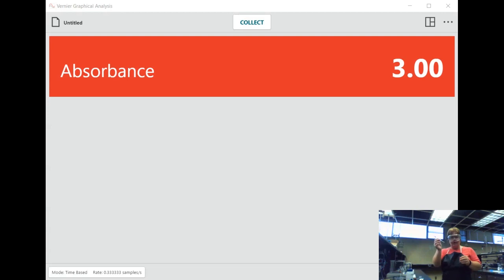And if you're not good at pouring, you can use a pipette and pipette it in. Put the top on. I'm going to wipe down the sides. So this is my stock solution. I'm going to add that in. I'm thinking it should be about 1.11 because it was when I did it with the other cuvette, but it might change. Look, this one's 1.17. So apparently this cuvette has a tiny bit of difference, and that's the importance of why you want to use the same cuvette. So I'd record down that the stock solution is 1.17. And I'm going to do this now. I'm going to repeat this process for my other solutions, for those diluted concentration solutions that we made.